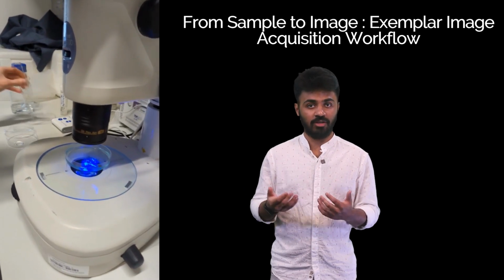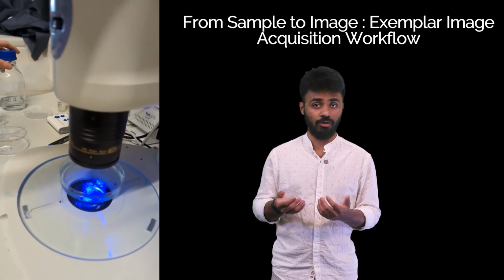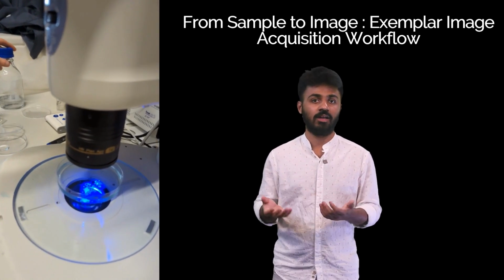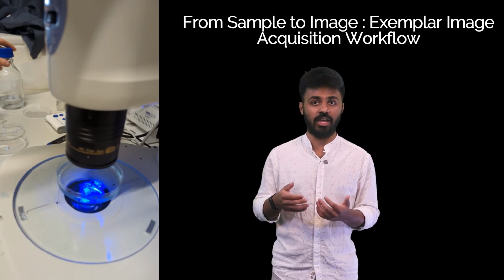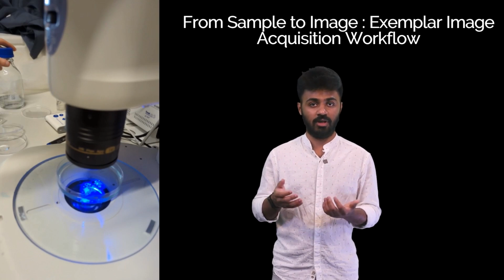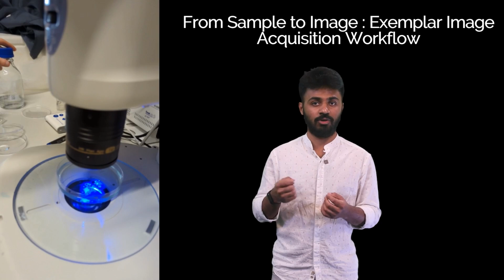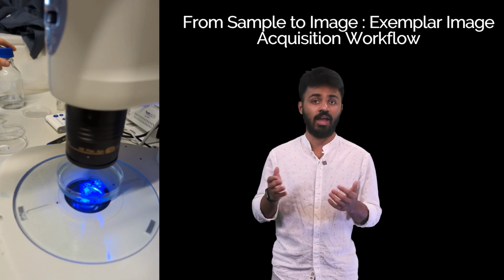Now that we have covered the basic concepts of image acquisition for biology, let's take a closer look at a real-world example. In this experiment, my colleague and I are investigating the dynamics of neutrophils following injury in 3-day-old zebrafish embryos using a high-throughput imaging setup. By capturing images of the neutrophils over time, we aim to gain insights into the underlying biological processes at play.